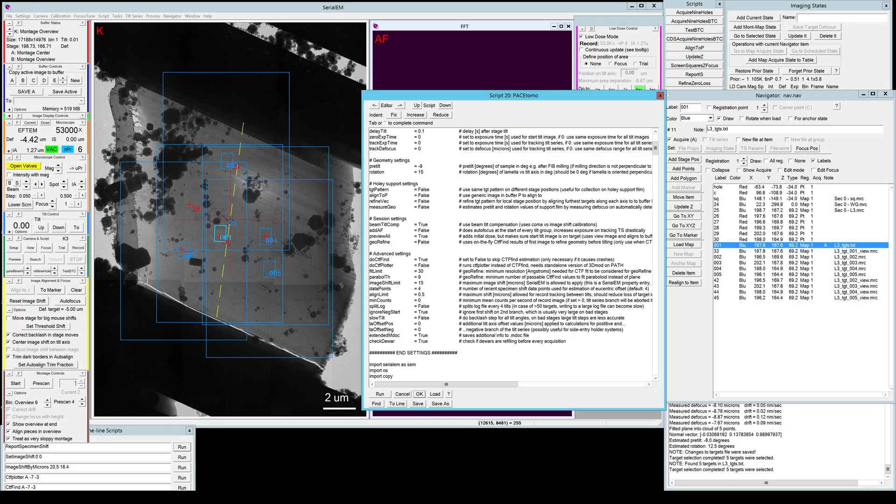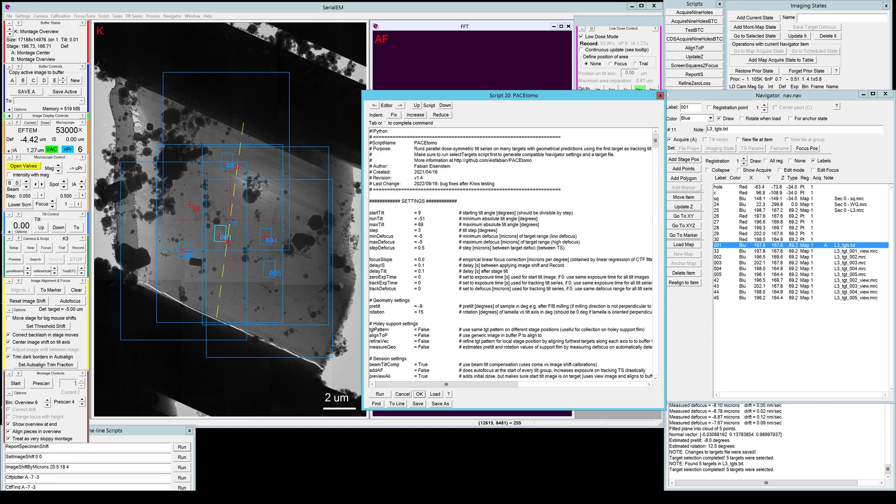And then we have a whole bunch of advanced settings that I'm not going to go into here. If you want to play around with them, I have some short descriptions here and some longer descriptions in the documentation on the GitHub page.